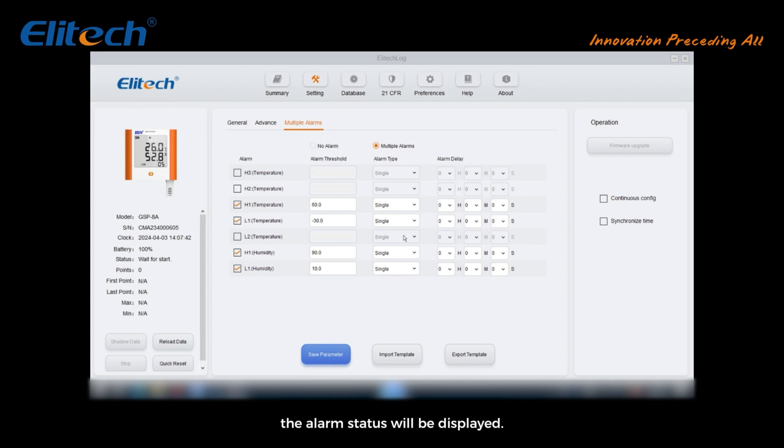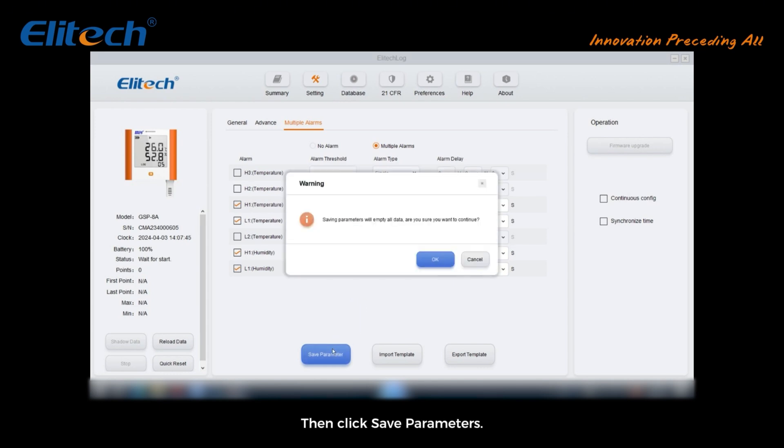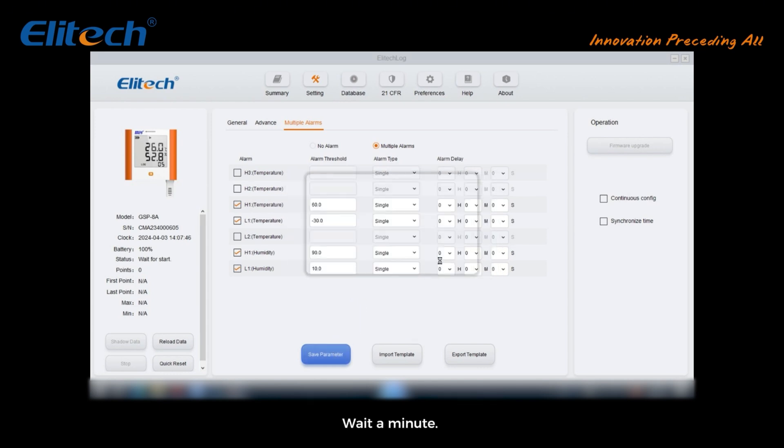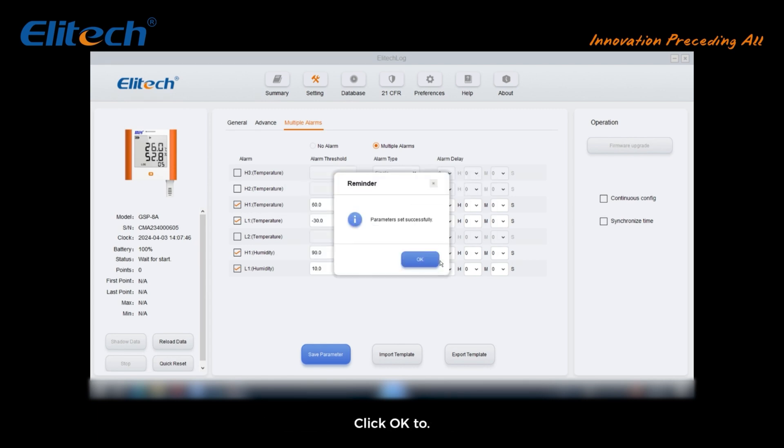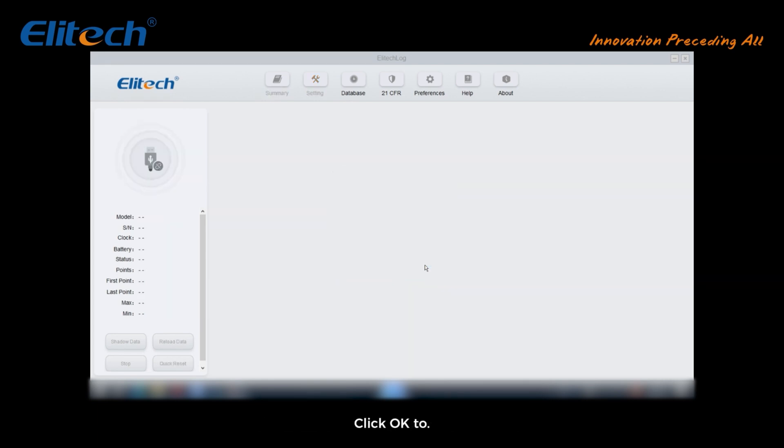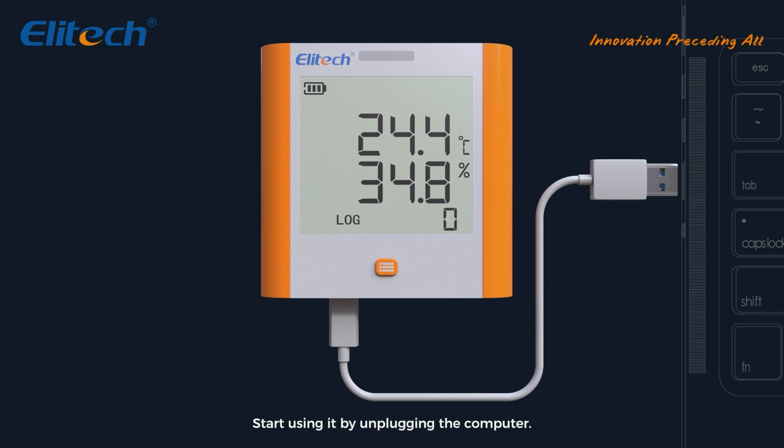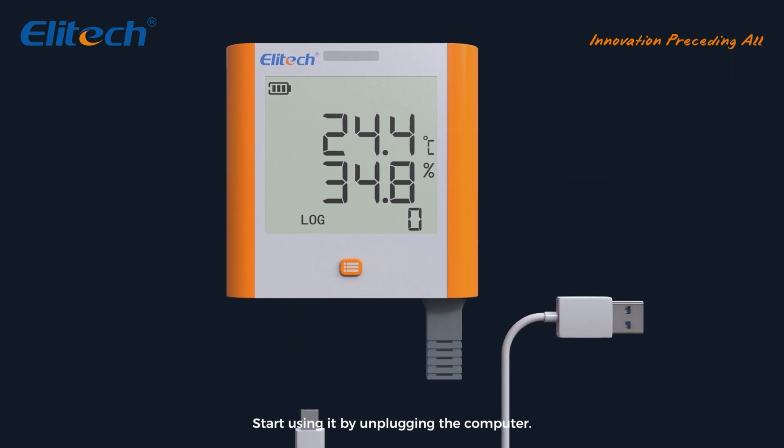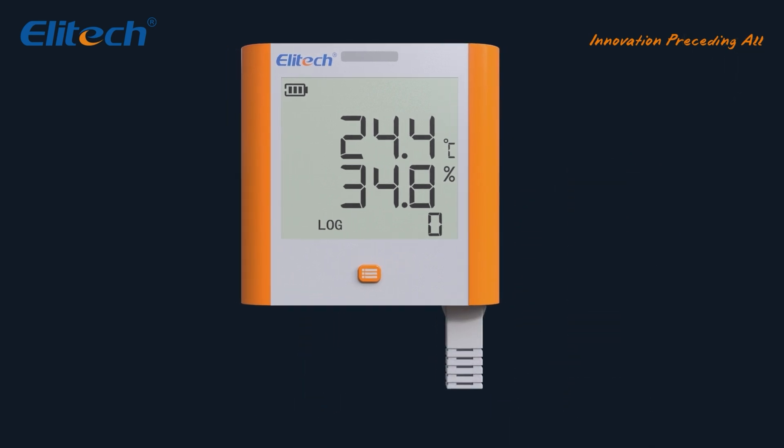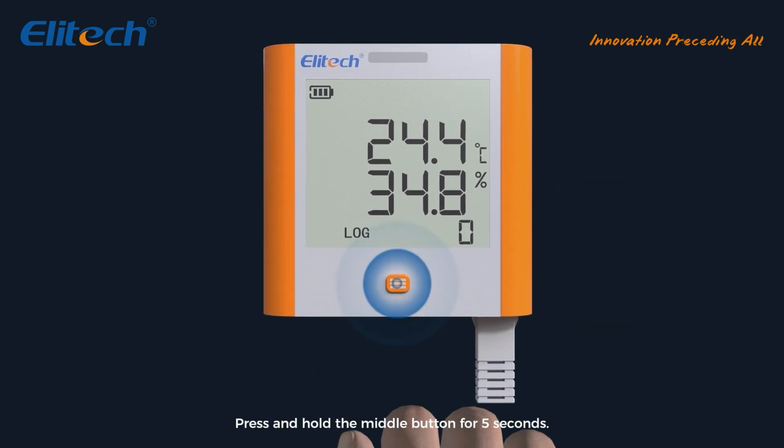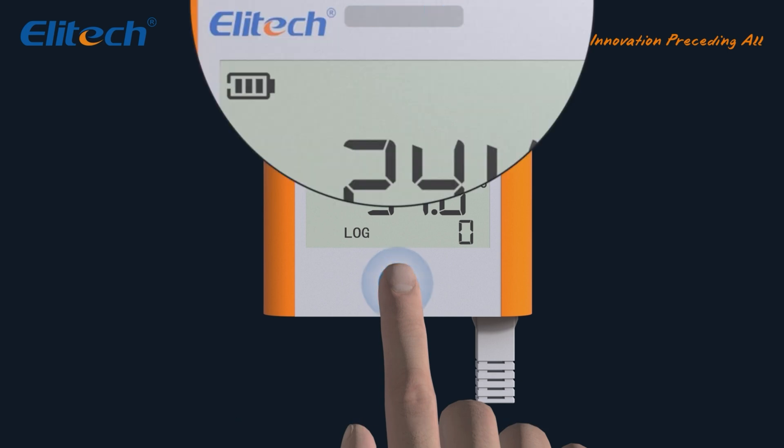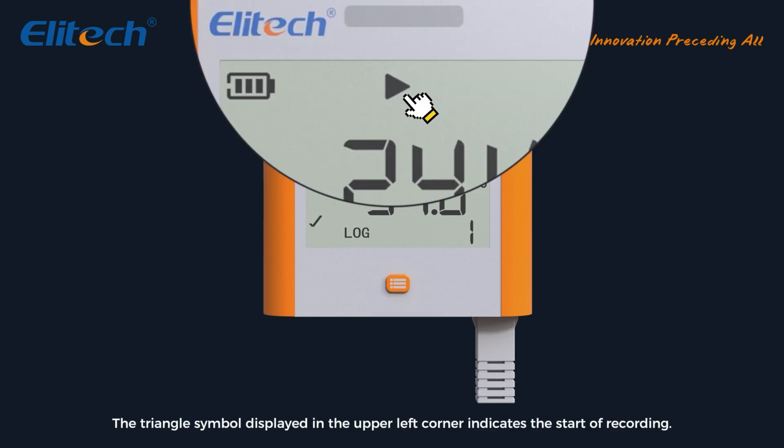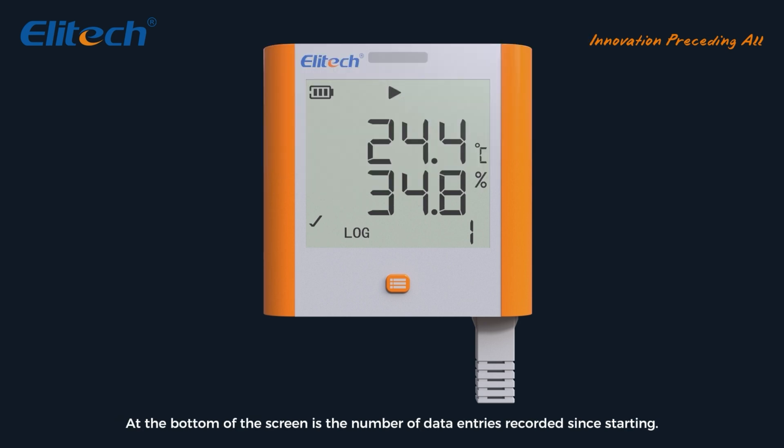Then click save parameters. Wait a minute. When the parameters are set successfully, click OK to start using it by unplugging the computer. Press and hold the middle button for 5 seconds to start record. The triangle symbol displayed in the upper left corner indicates the start of recording. At the bottom of the screen is the number of data entries recorded since starting.